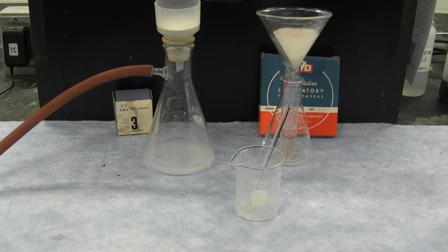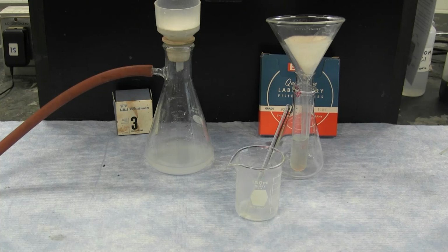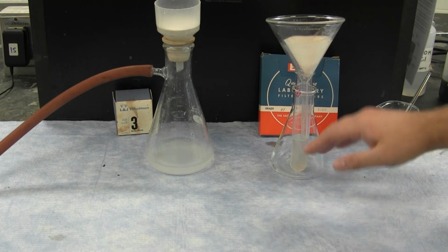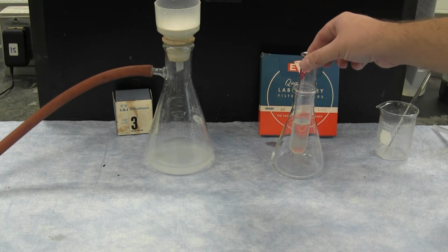In the second part of the experiment, you're shown the gravity filtration technique on two separate reactions. To the filtrate, which is the liquid that passes through the filter paper, two additional tests are performed.